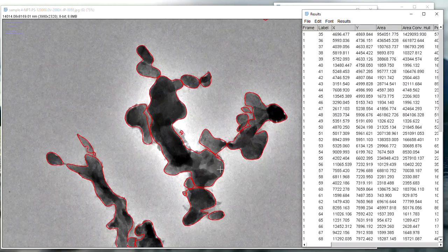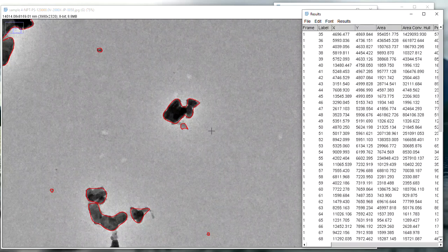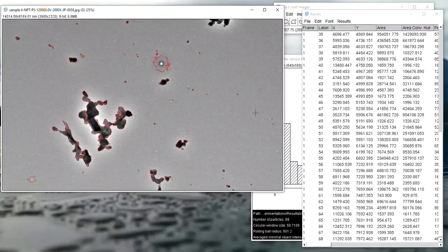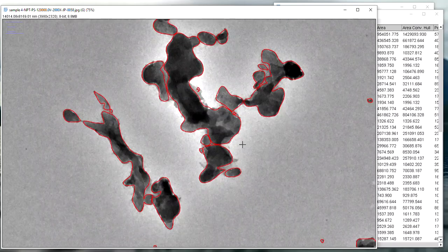Then when you look into here, you can ask yourself, has it selected the particles correctly? You can click on the image to take the selections off. Right click and restore particle selection to compare. Here you can see that it didn't really cut out enough. Same thing here. You can zoom out, I'm doing control scroll with the mouse, and zoom back into a different area. Also assess how well these two parameters are adapted to our image.